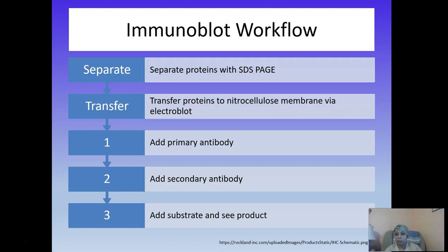It's going to be important, one, to decide if it's a good one to use, but more importantly, it's going to be important to go to the next step when you are enhancing the signal and you are getting ready for detection. The secondary antibody that we use in a Western is going to be to those IgGs on your antibody that are going to come from the host animal.